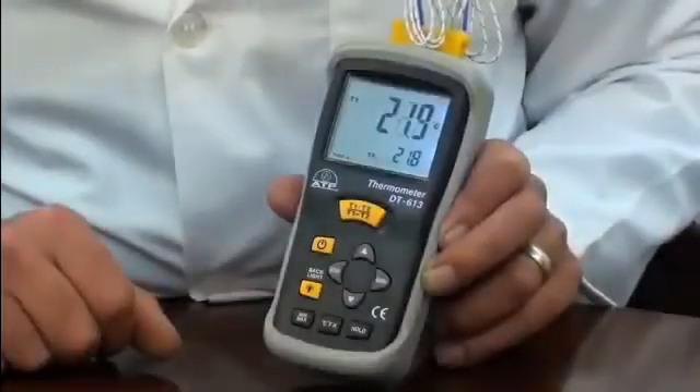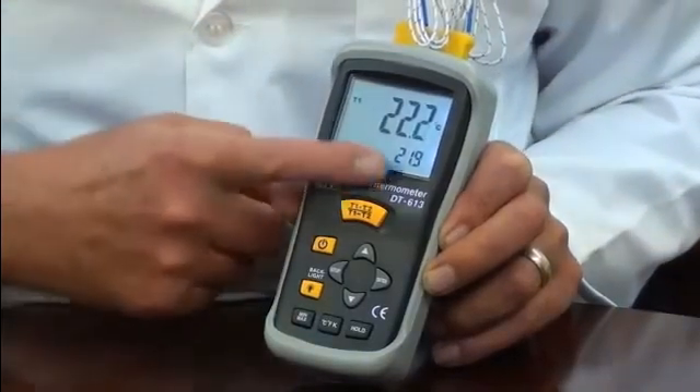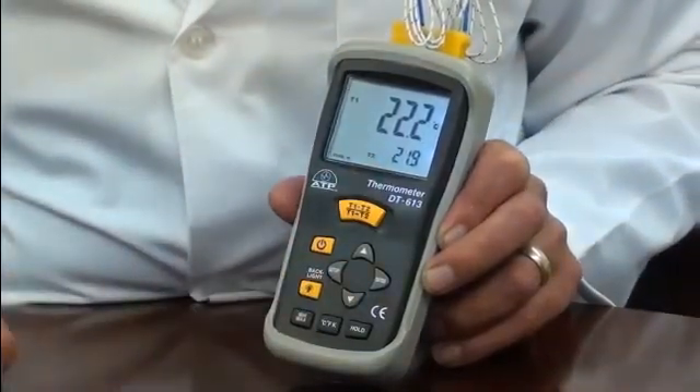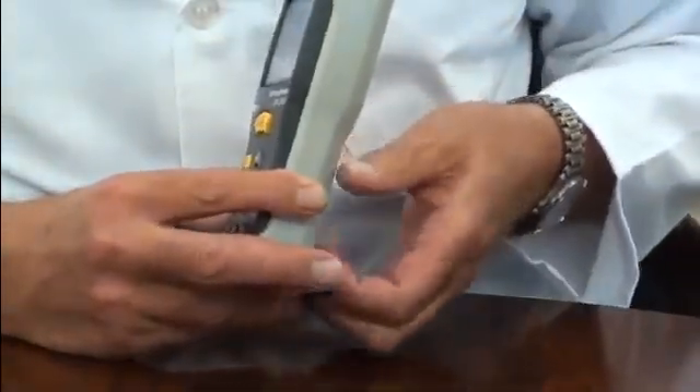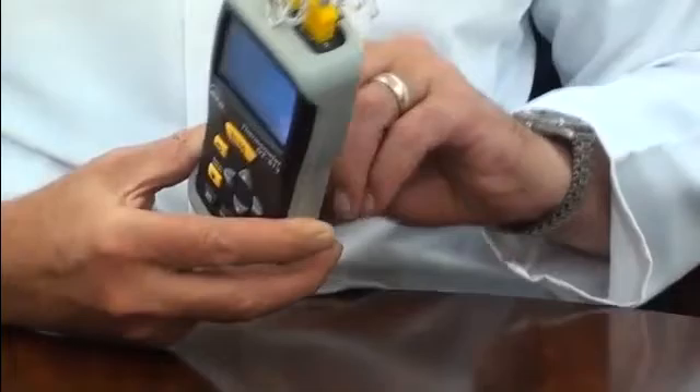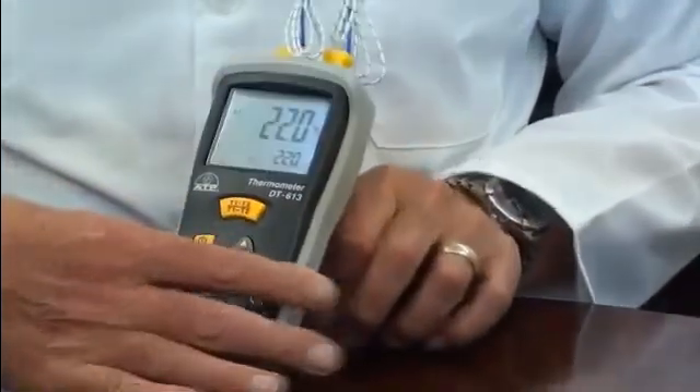The instrument case is manufactured in impact-resistant ABS plastic and has non-slip rubber function buttons. It is supplied with a rubber protective holster, which makes this thermometer ideal for use in harsh working environments. It also incorporates a flip-out desk stand for bench work.